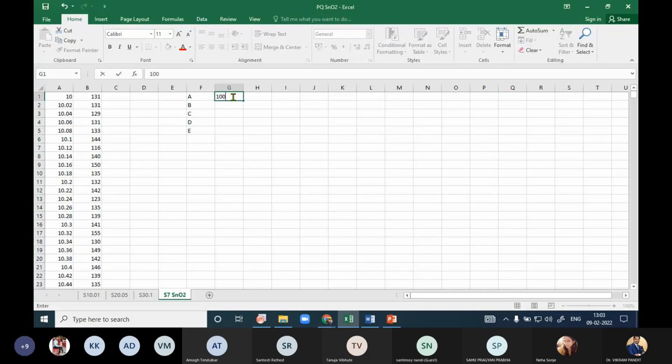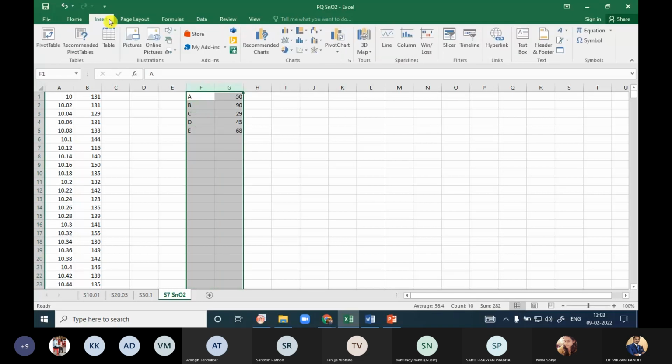One person got somewhere 50, another got 90, then 29, then 45 and 68. So I have selected it and gone to Insert.